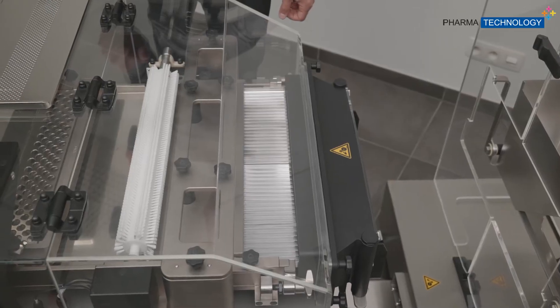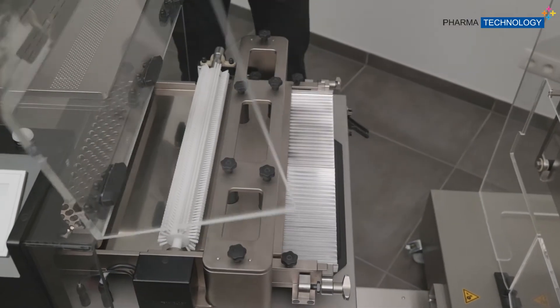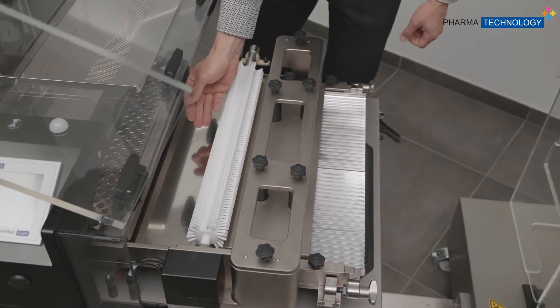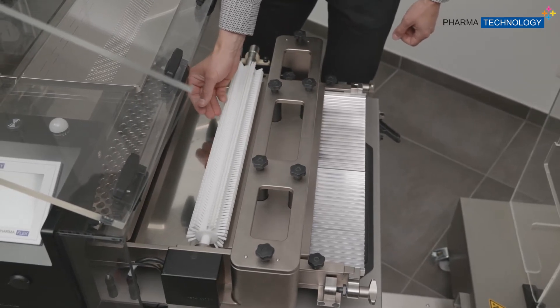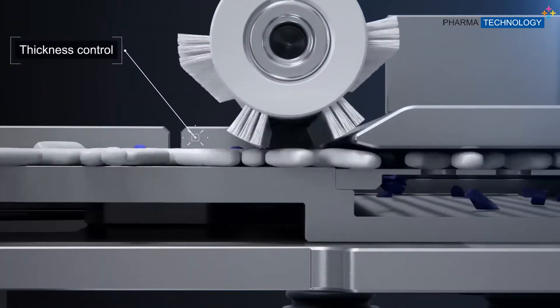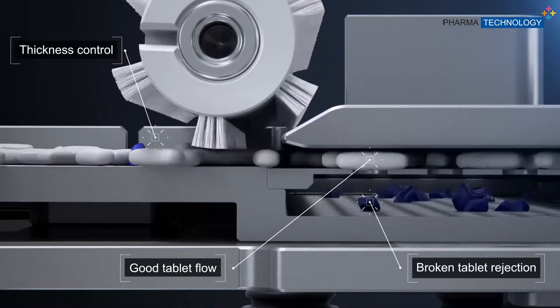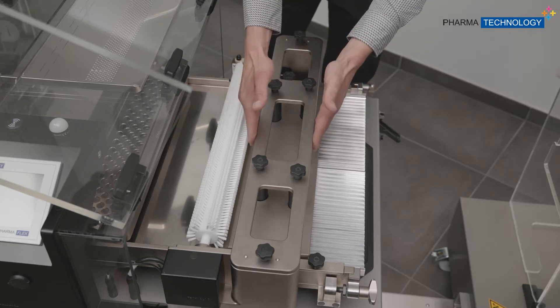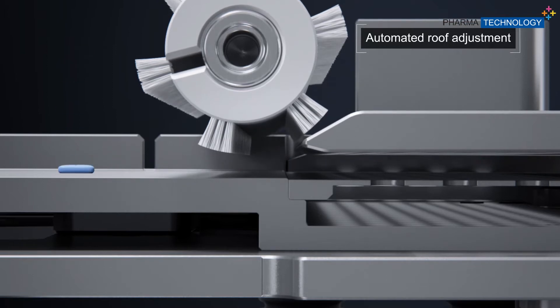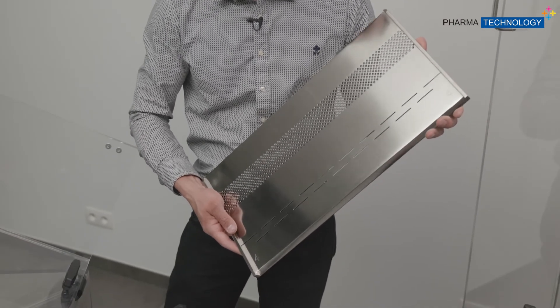After the pre-feeder, we then enter the sorting area. Here the tablets will fall onto the sorting plate, which is also a vibrating plate monitored by a vibration sensor. We then have a rotary brush, making sure that we don't have tablets on top of each other or tablets on the sides when they are oblong. Then we have the roof system, which makes sure that the tablets fall at the right moment into the sorting plate.